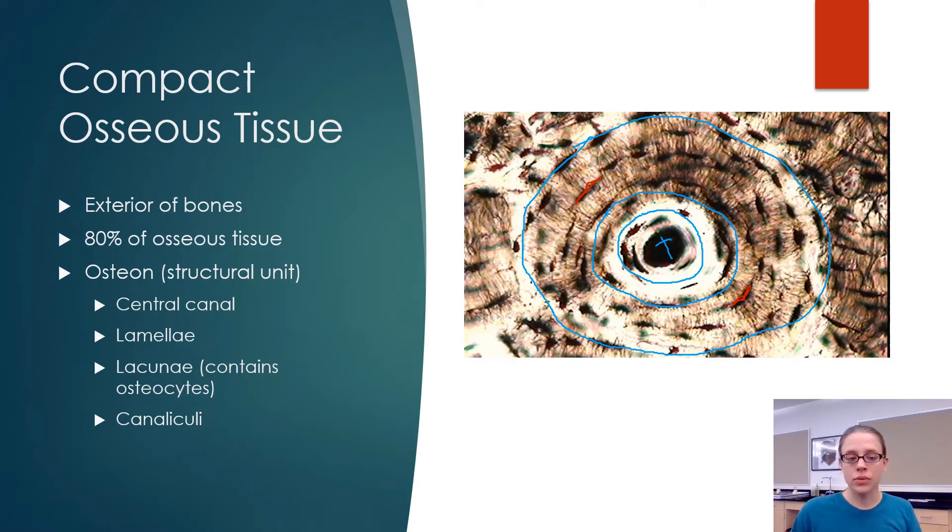Now in between the lacunae we have canaliculi which are the little black lines radiating out from the center, radiating out from the central canal. All of these tiny little black lines coming out from the center, those are all canaliculi. The root word there is canal. The canaliculi are little passageways that are connecting the lacunae to each other and to the central canal to allow nutrients and other material to pass between them.